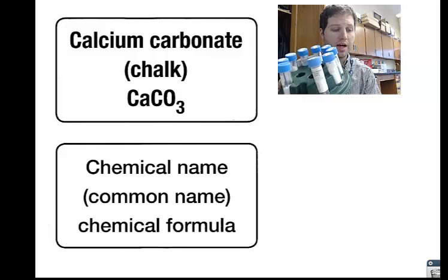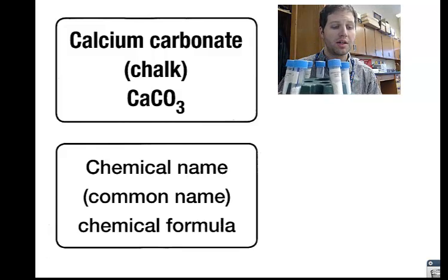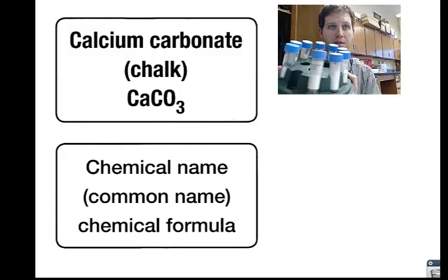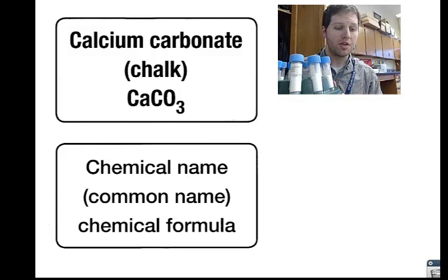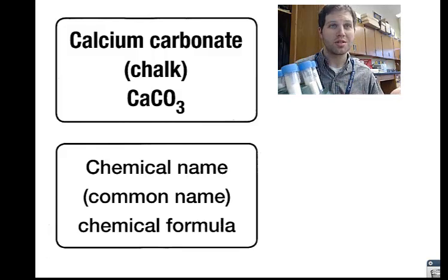This is a set of 9 vials containing white substances. Each vial has a different pure substance. There are no mixtures in these vials. 2 of these substances are the mystery mixture. I don't know which 2 they are. Your job is to try to figure it out.